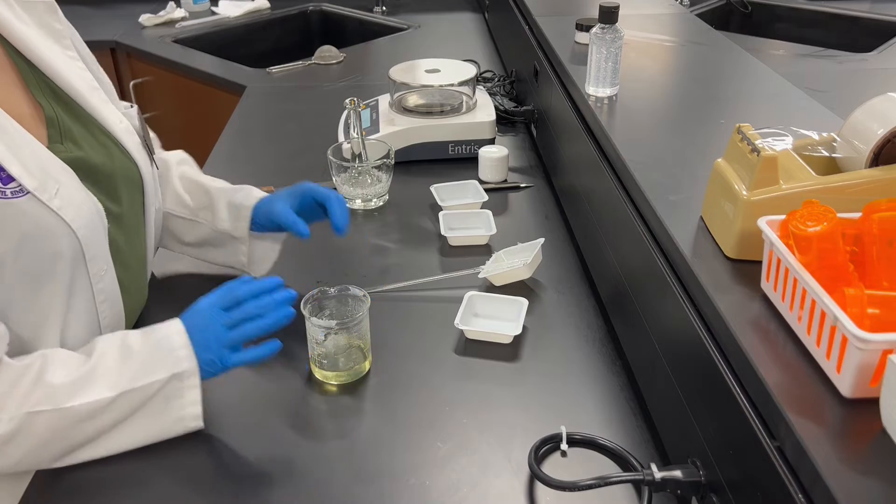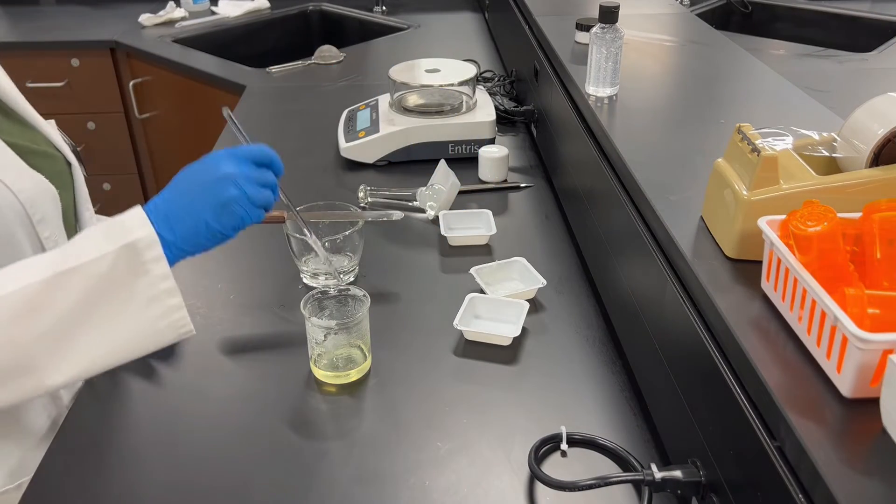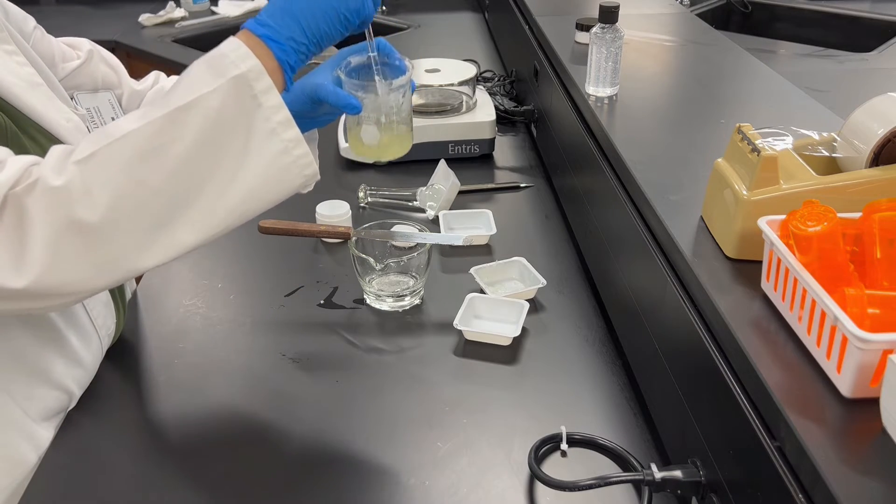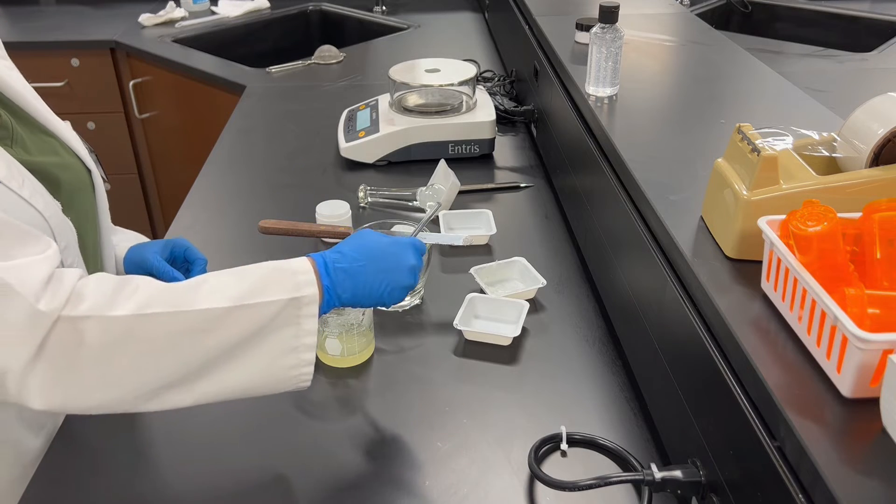Now that it's melted, what you're going to do is you're going to take your glass stir rod and then you are just going to stir it until it becomes cloudy. Once it is cloudy, you can go ahead and add in your ingredients from your pestle and mortar.